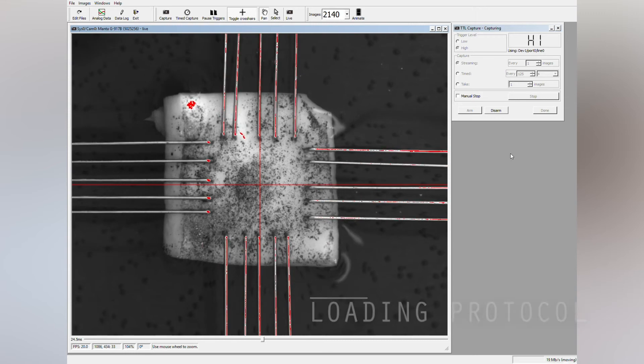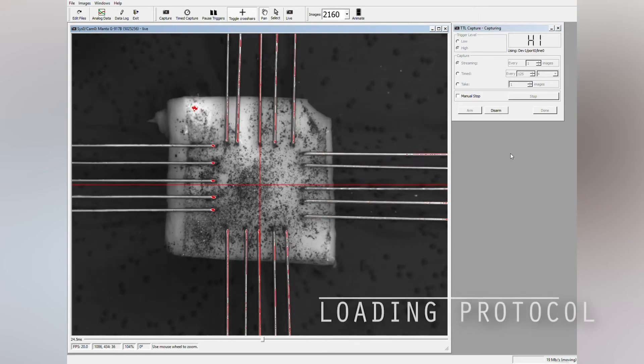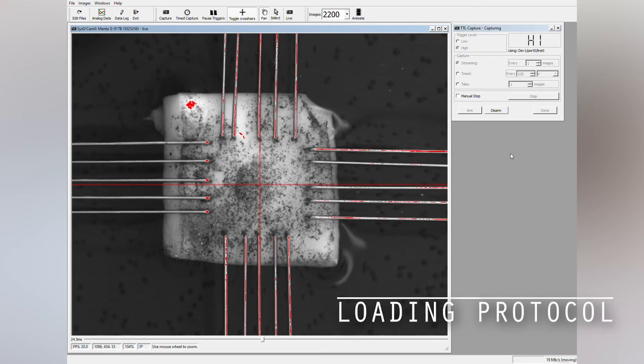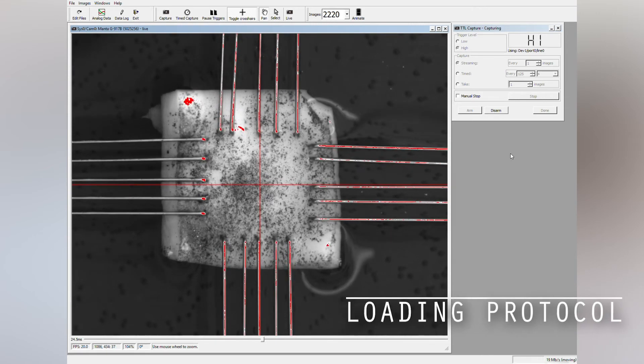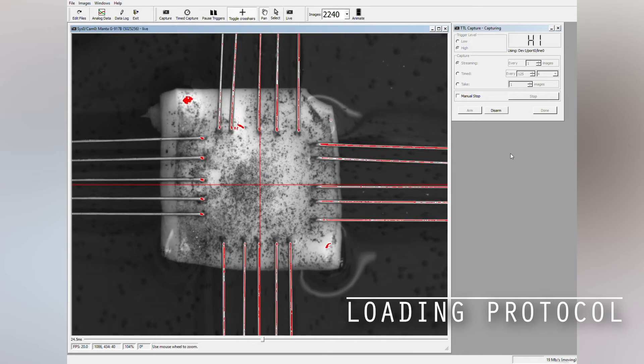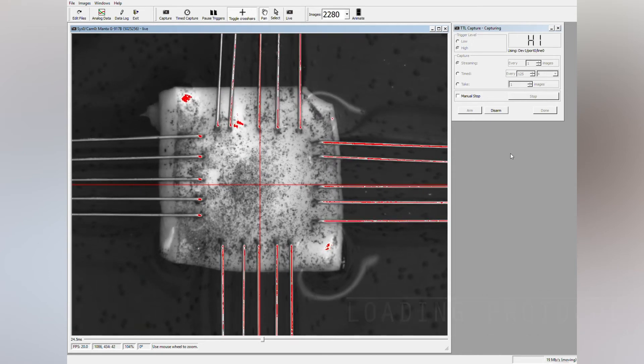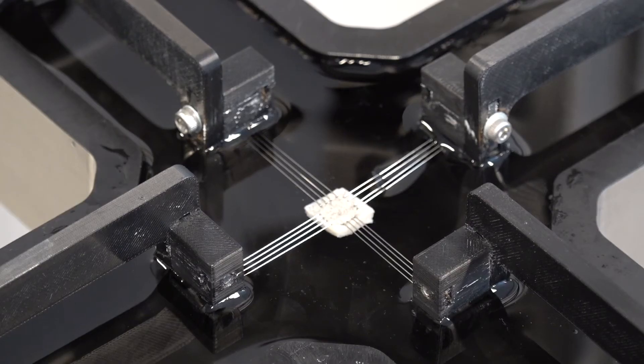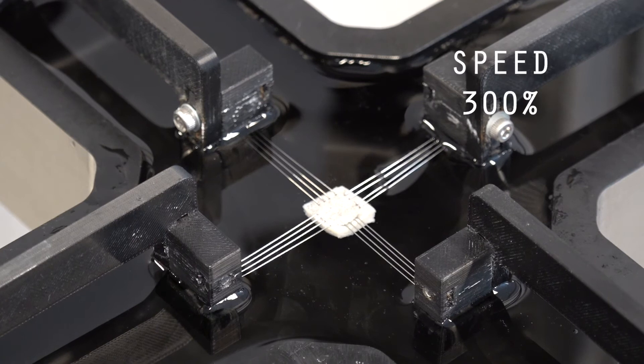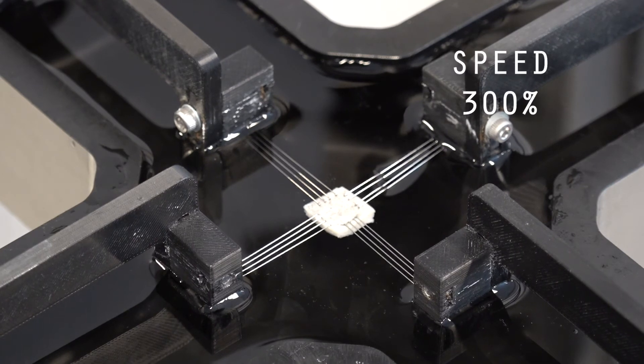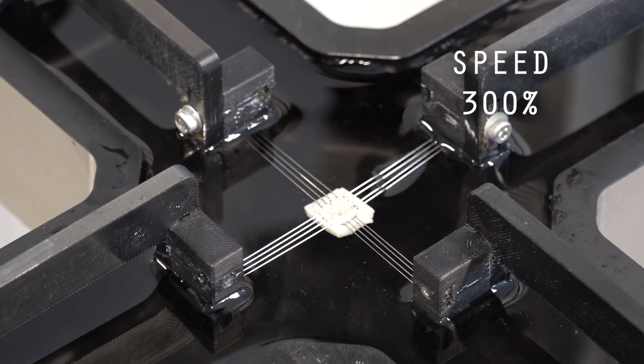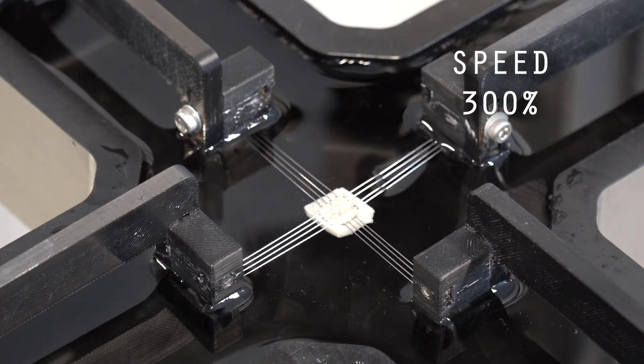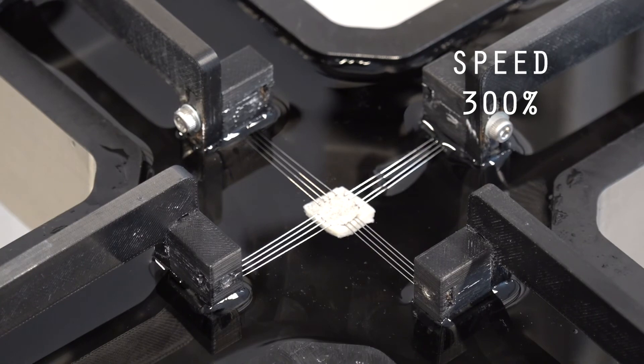The sample is then loaded along the four edges. The loading protocol can be either force controlled or displacement controlled. From a control point of view, force control is more complex, because it requires a feedback loop between the force sensors and the actuators.